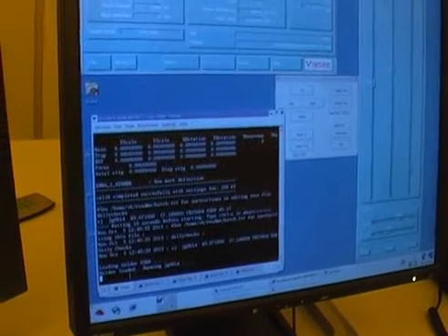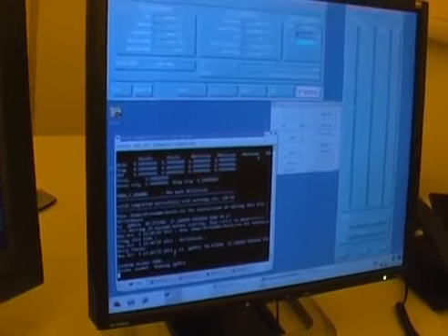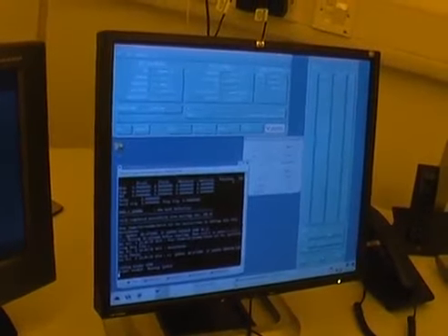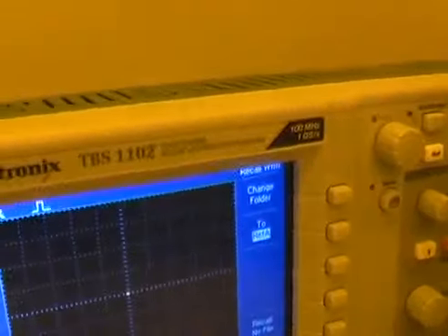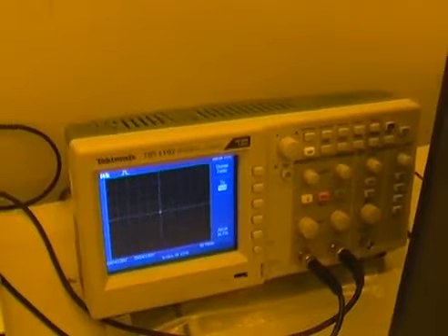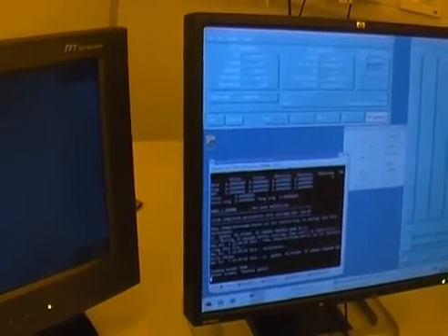And now it's started. It says running this job. You won't see very much on this particular screen. All the information is being sent to a log file. What you can see over here is occasionally the little dot dancing around when something happens. And we'll look at that in a few minutes when it starts calibrating. I'll point things out. So this job will take about 10 minutes to run, then it will finish and we can unload it and return it to the user.